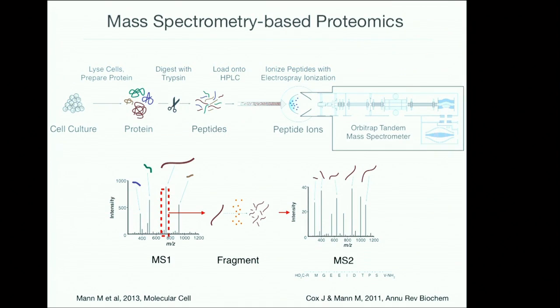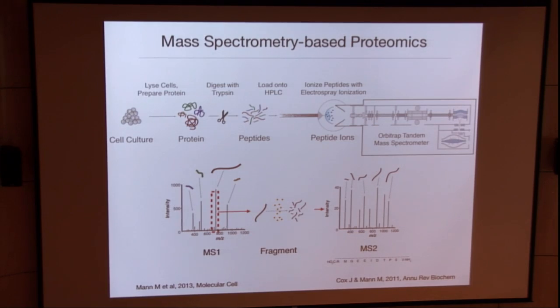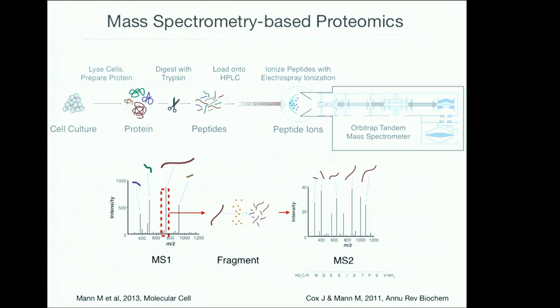So we now, of course, want to use the mass spec-based method instead of the RPPA, because RPPA, although it's powerful on a sample size level, has variable specificities of the antibodies. So for the tumor projects, we're collaborating with Rudy Aebersold, who is doing targeted mass spectrometry of the tumor samples.